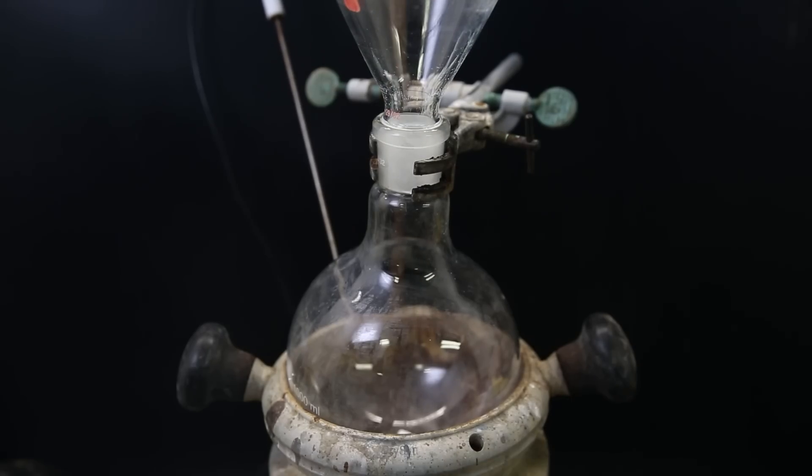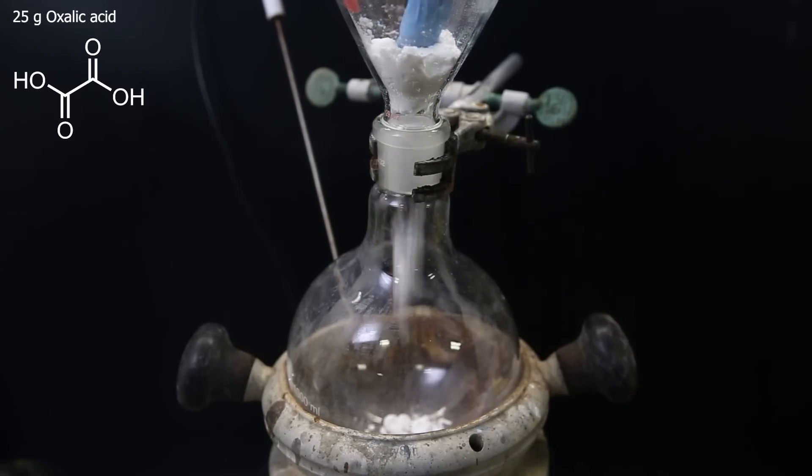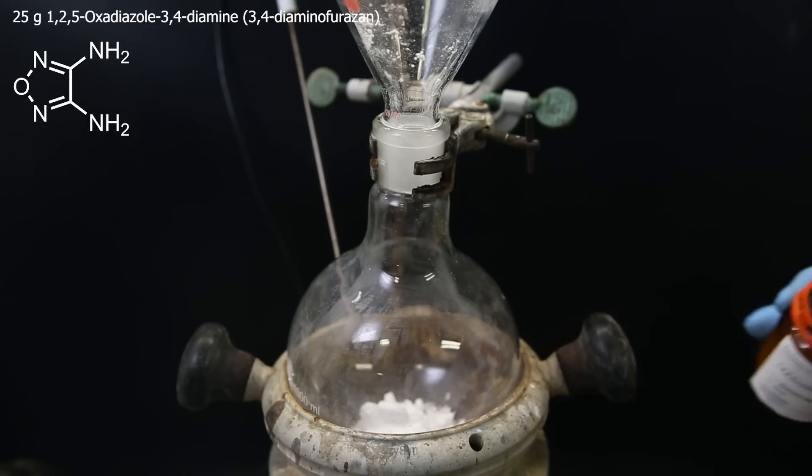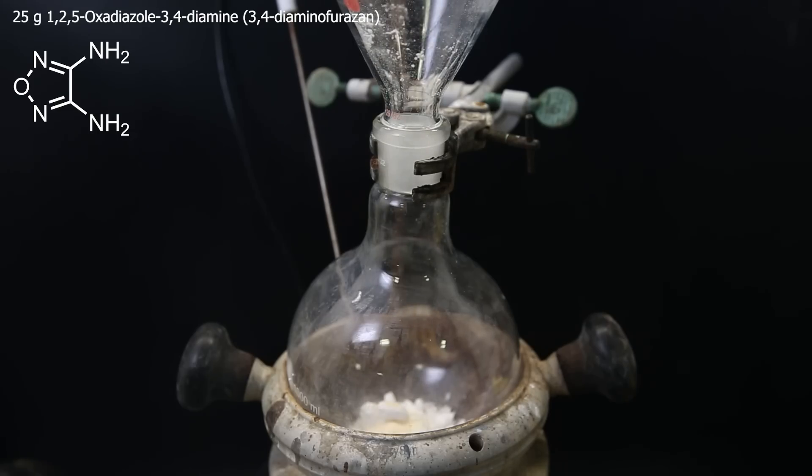So to get started, I set up a flask in a heating block and add in 25 grams of oxalic acid as the first reagent. Then as the second reagent, I add in 25 grams of 3,4-diamino-furozan, which is the whole bottle.